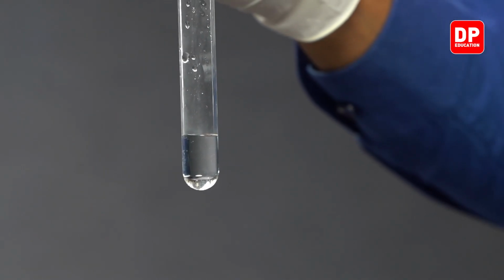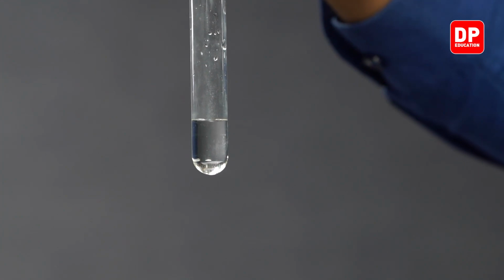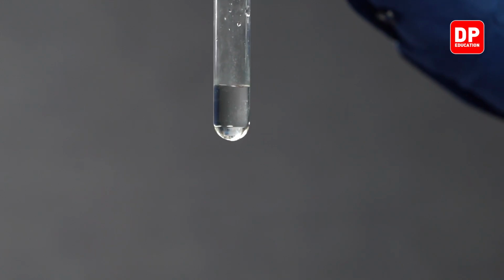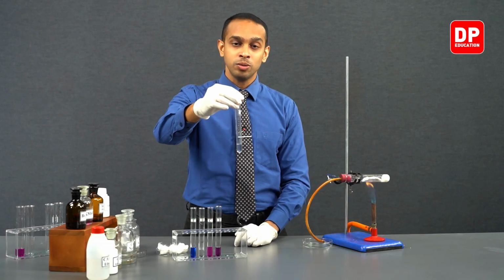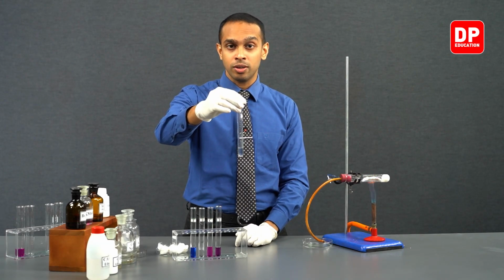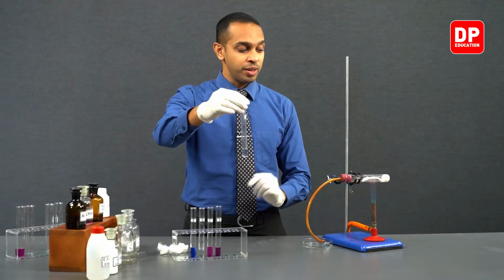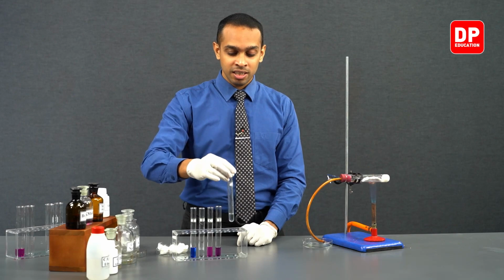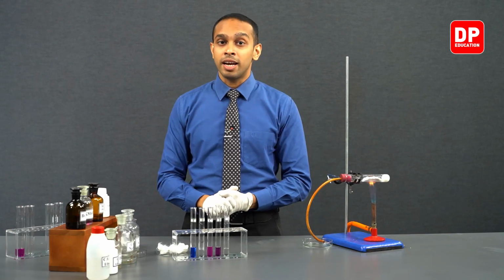So this is now almost entirely colorless. You can see here, initially when we were starting off, bromine water was not this color. Bromine water had a yellow hue to it. Usually bromine is red-brown in color. Bromine water will have a brown or yellow color to it, and you can see the yellow bromine water that we took is now colorless after sending ethene gas through it. This indicates that the gas that we produced was in fact an unsaturated hydrocarbon.